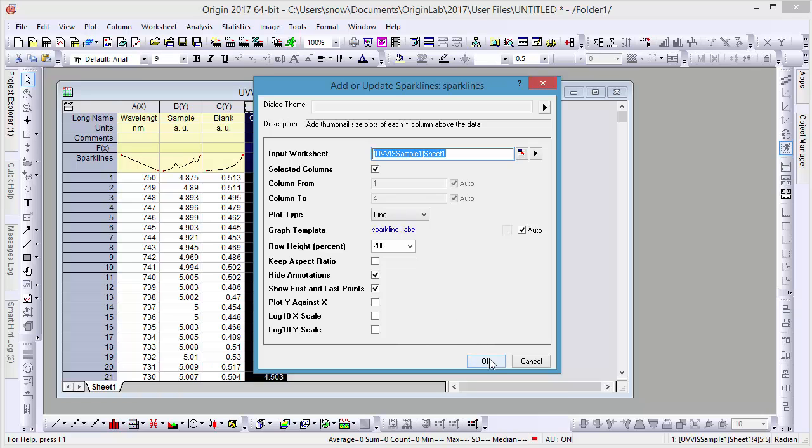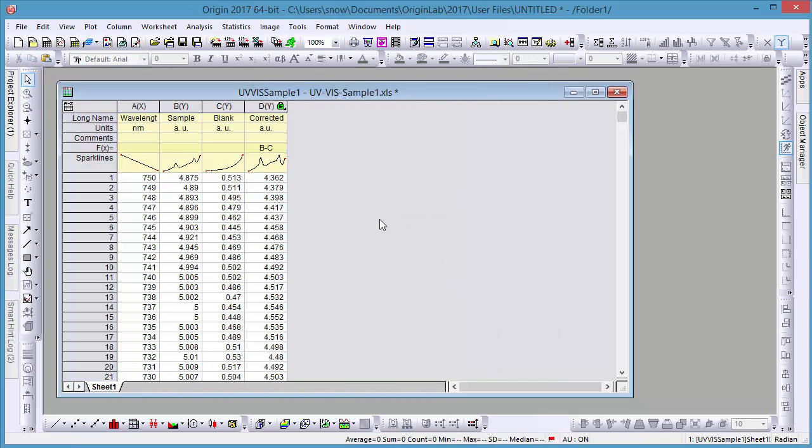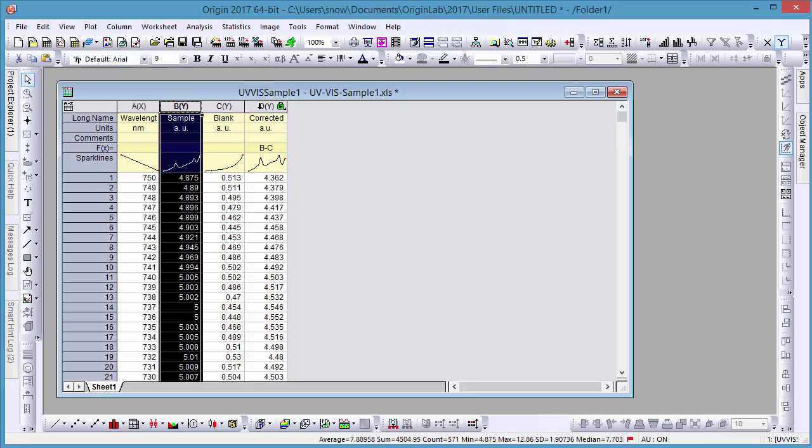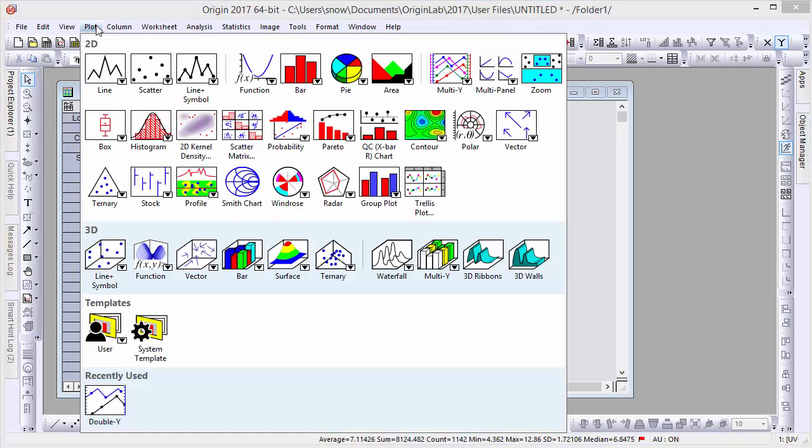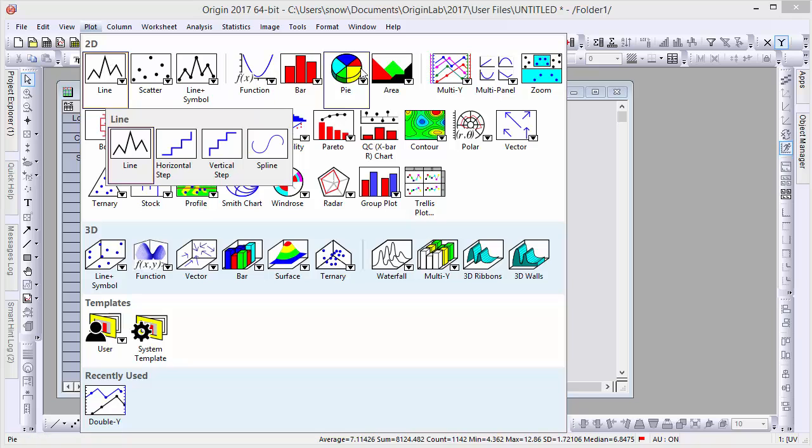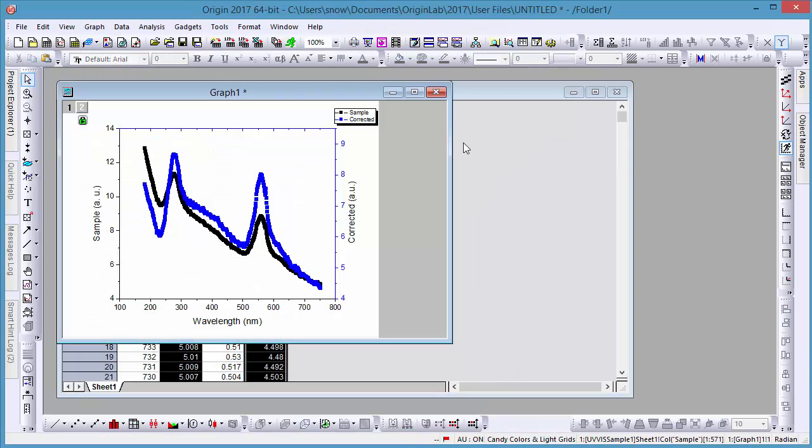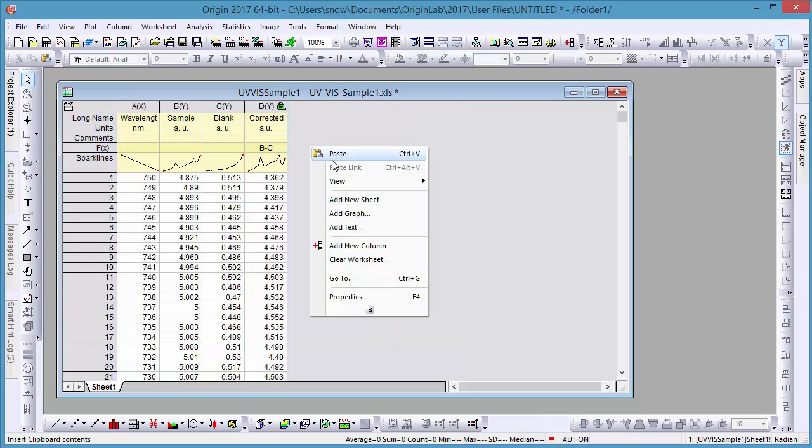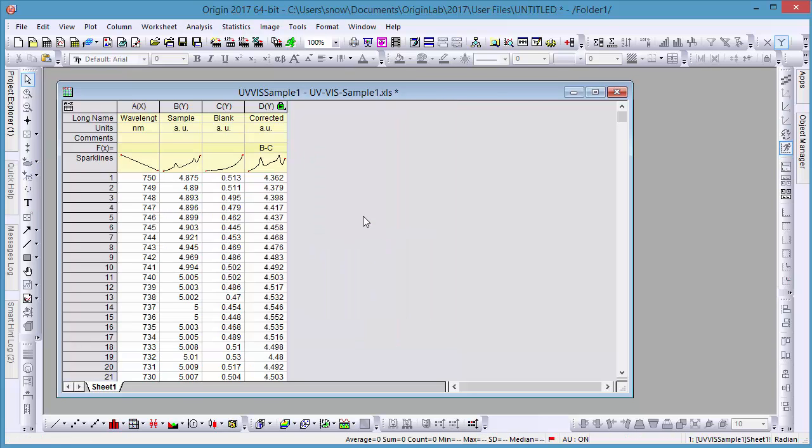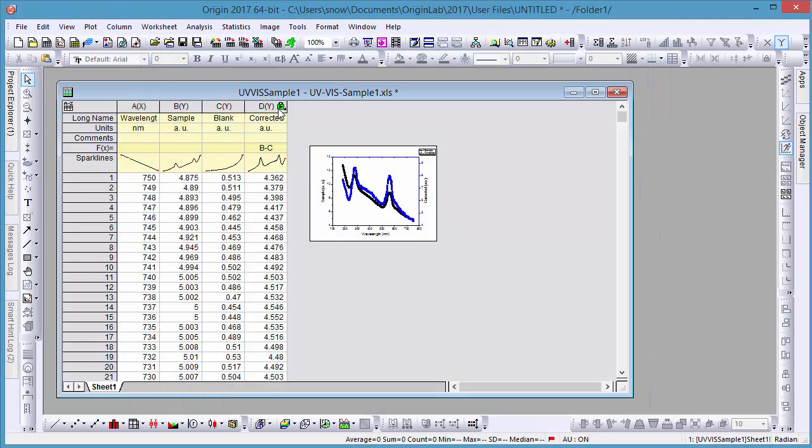Now let's plot a double Y-plot of the sample data and corrected data. If we want to include our graph with our data, we can add it as a floating graph in the same worksheet.